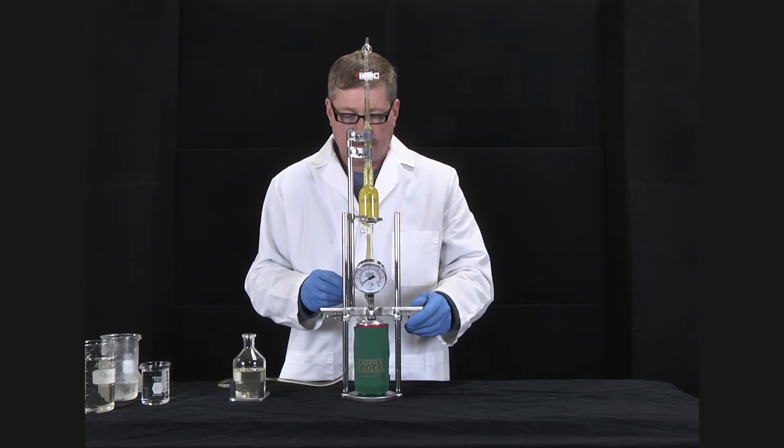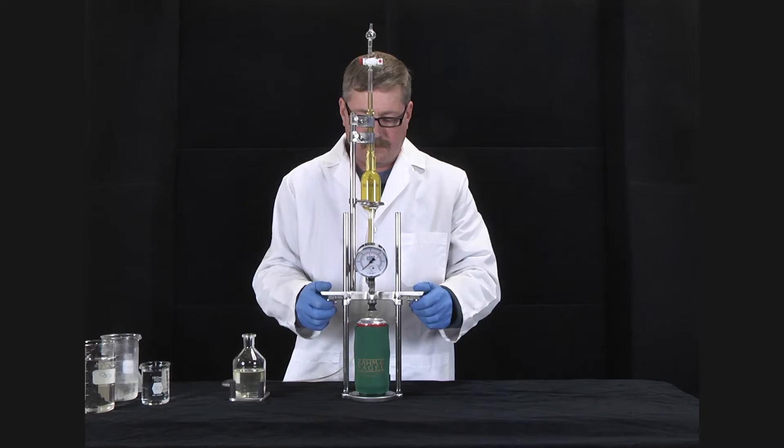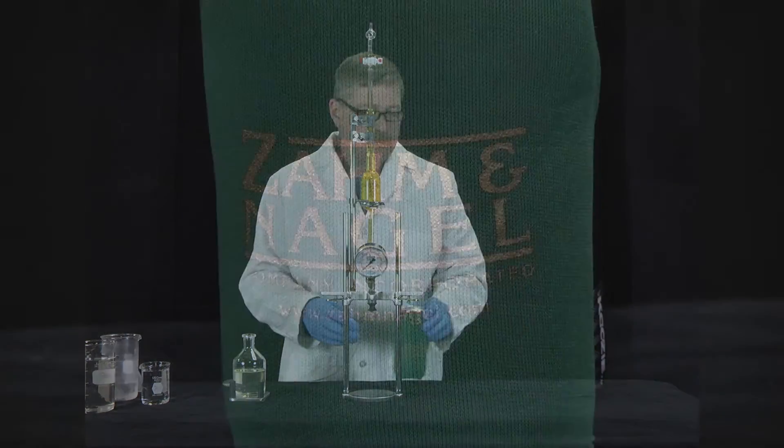Bleed off any remaining pressure in the container through the whitey valve. Depress the lock plates and raise the crossbar to a level that will allow removal of the container.